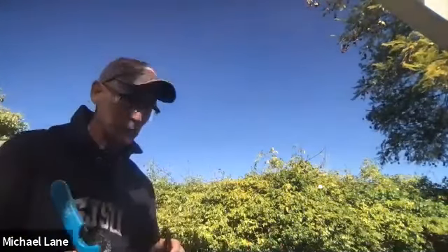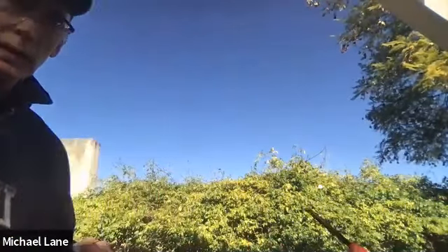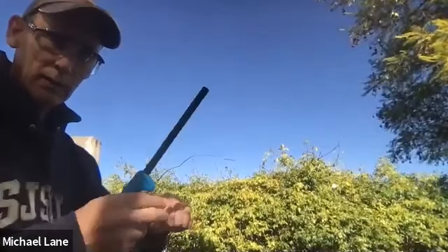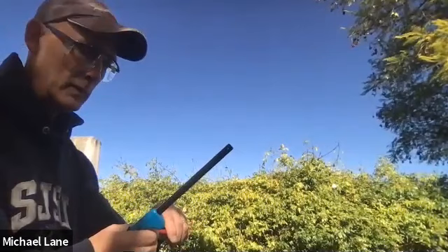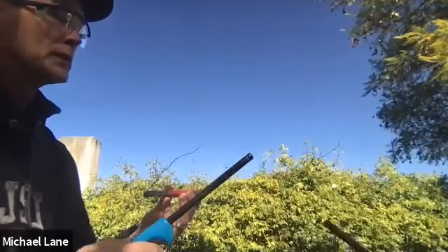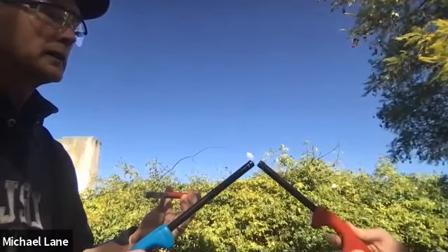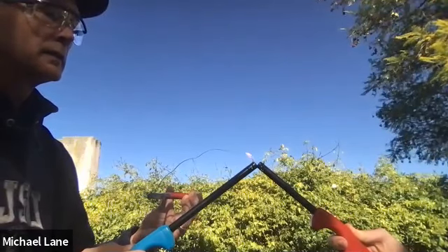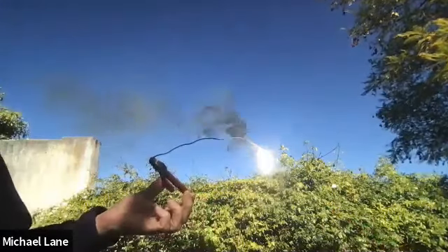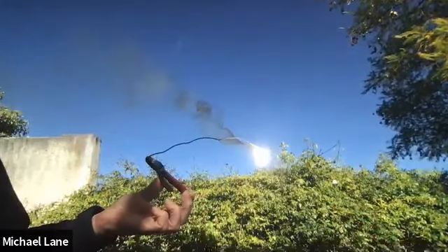So let me get this positioned, and I'll hold it. Pardon me while I adjust a couple things real quick. Okay, I think there we go. We've got that as well as we're going to position it. So put the flame right there on the end of it. There we go.